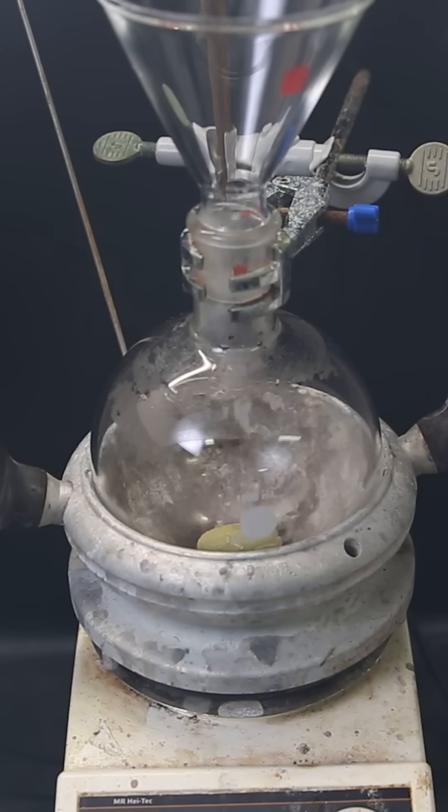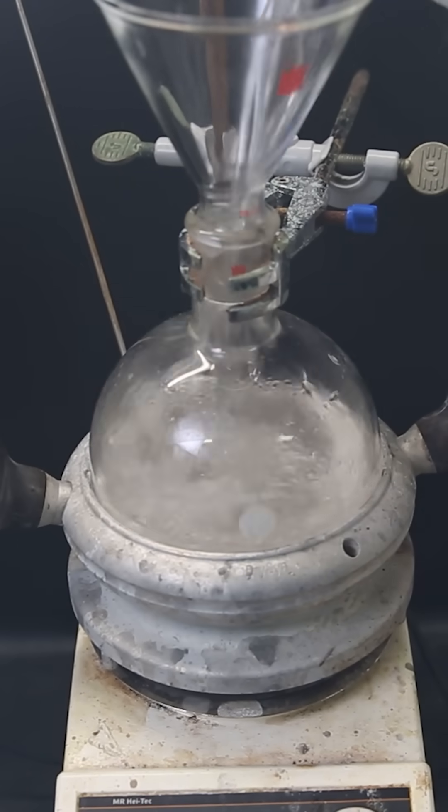After that, it turned cloudy. I then set up a flask again and add in a bunch of potassium hydroxide and pour all of the carbon tetrachloride on top.